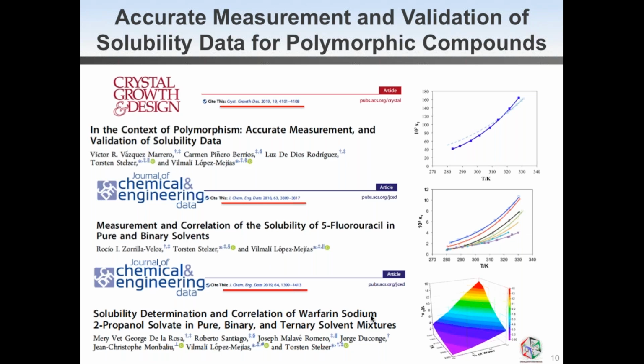I will take one more question from Eliandro Nicolas Aibar. Hi, I'm from Sinton, Argentina. And we are working on a process in which the solid is crystallized from a mixture of methanol, DMF, and some salts of zinc chloride, and the API solid product we intend to obtain in pure form. The question is, is it the right way of measuring the solubility of the pure form, or is it better to perform the measurement on a mix, I think, is what they are saying?